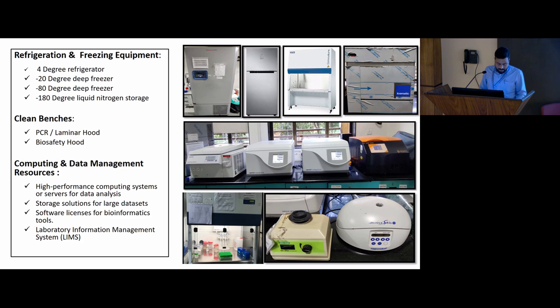A high performance computing system is also required for data analysis and for storage of large data sets. It is also important to have a laboratory information management system. It may be developed in-house, but it is very helpful in arranging reagents and sample tracking.